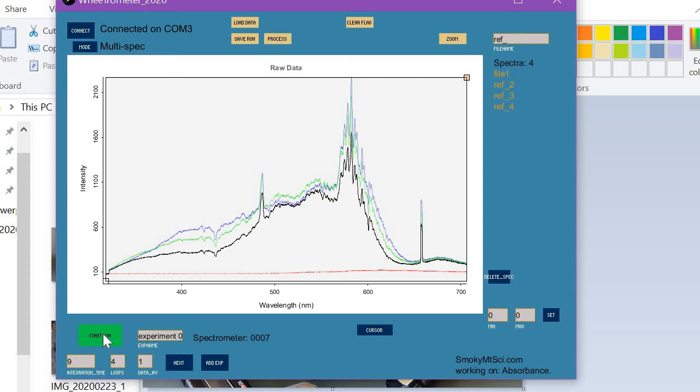All right, that's our second concentration. We have a total of 5 different concentrations, so we will look at them in sequence. Did I do that? Nope. Gotta make sure I actually hit the button here. Okay, we have 1, 2, 3. This will be number 4. I have a little shield that goes on that covers up the sample. Alright, this will be our last sample, and we'll hit the button again.